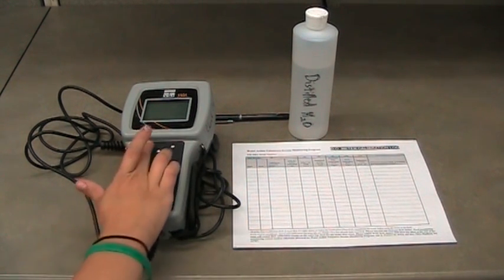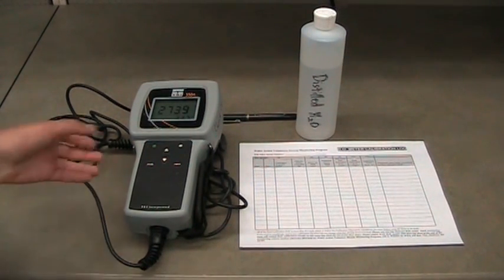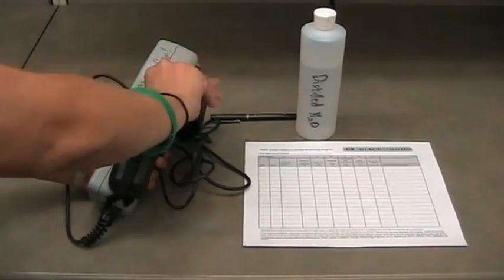Turn on your meter and wait at least 15 minutes for it to warm up before you begin the calibration process. Verify that the sensor membrane is in good condition. To do this, check that the sponge inside the probe chamber is still moist.